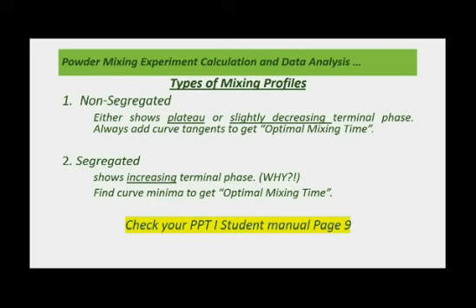Here, find curve minima to get optimal mixing time. Please, to see how to add the tangents, check your PPT student manual page 9.